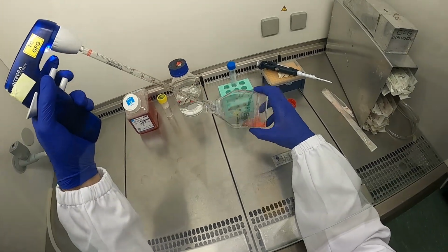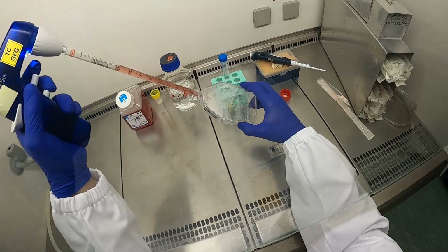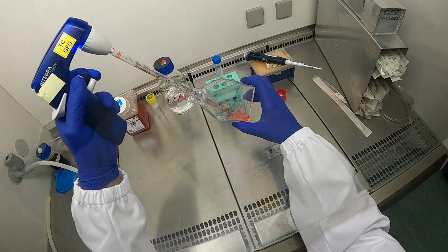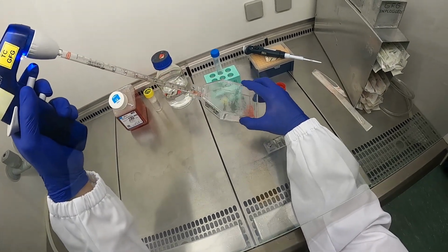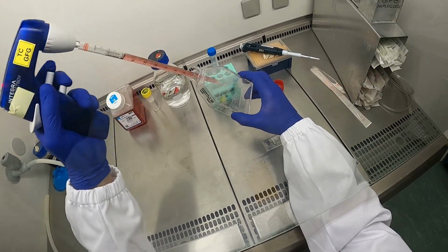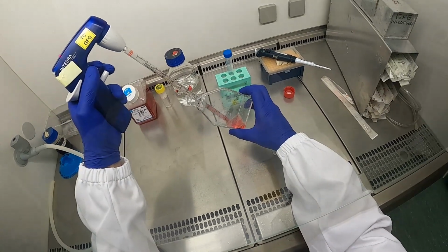So what you're doing here is just flushing the cells off the bottom of the flask. In case there's still some attached, they will certainly come off once they're well trypsinized. And many of the cells might still be attached to each other. These cells really love to stick to each other and form lumps.